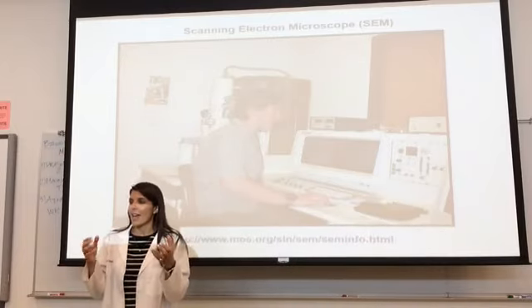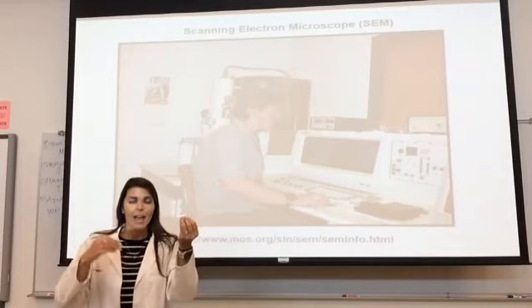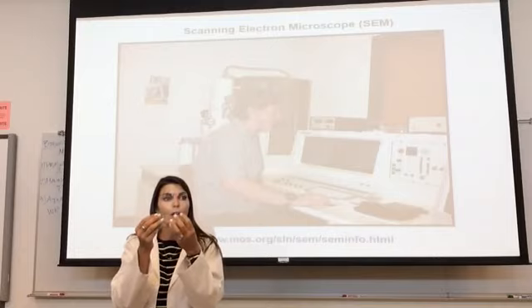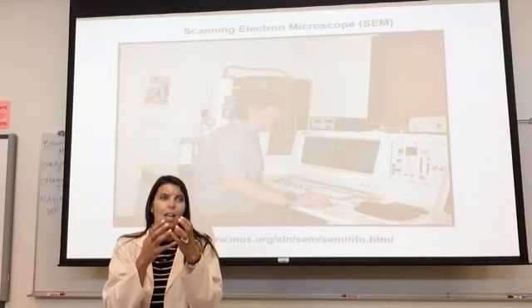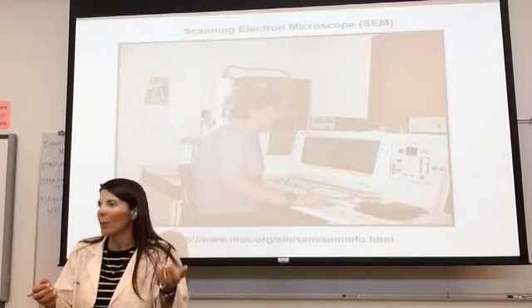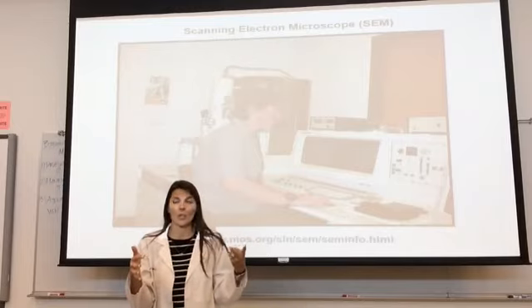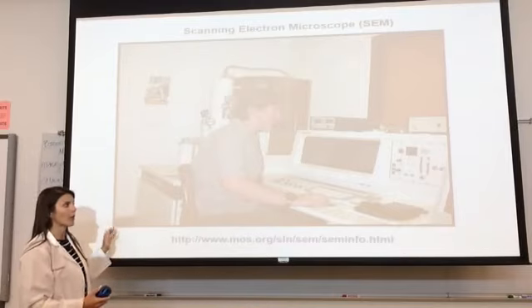Like the one that I saw demoed, they took a human egg, a female egg, and a sperm from an in vitro clinic, and they were really close to one another. They were able to stop them, coat it with metal, and you could see it in 3 dimensions. It was incredible, to see the surface of a human egg and know that it's absolutely super tiny. This microscope pulled it up and made it look super clear and big. It's crazy powerful. It also coats in metal, but you can see in 3 dimensions here versus all the other ones that are in 2D. Okay? Very, very interesting microscope, especially for those people going further into research.